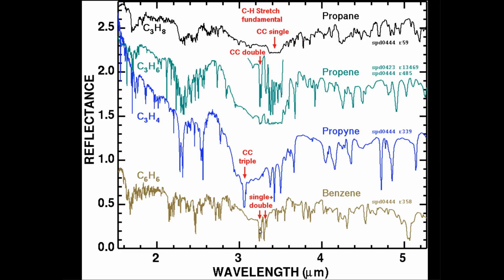And then for single bond, double bond, and triple bond, the fundamentals shift position, and that translates into shifting at other wavelengths too. We have in Tetracorder currently a number of organic compounds. We have reference spectra for many more, and just need time to add more in.